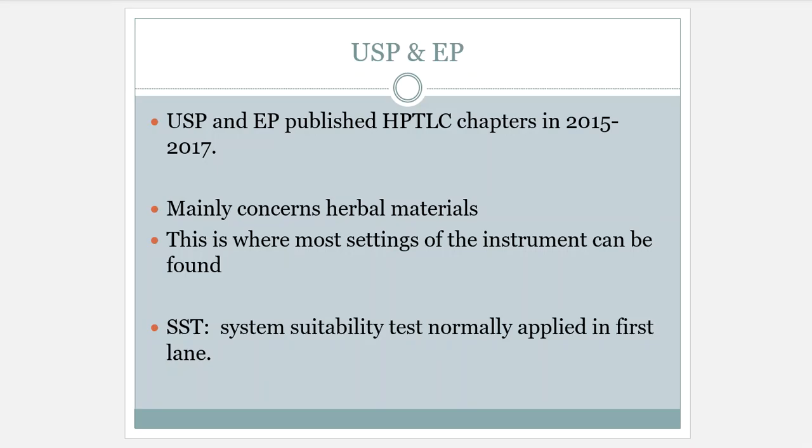You're going to find a lot of the information about dietary supplements and how to prep them in those general chapters. Everything from the plate dimensions that we need to input into the software and into the machines, you're going to find in that general chapter we are referring to in USP-NF. So that's where a lot of this information came from.